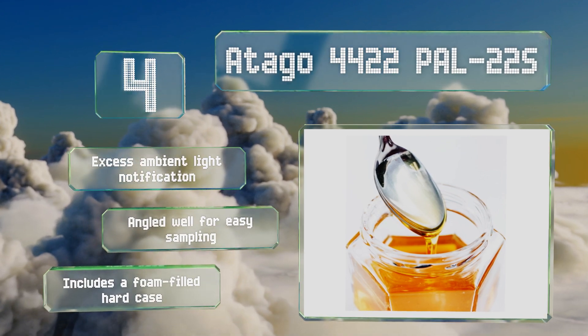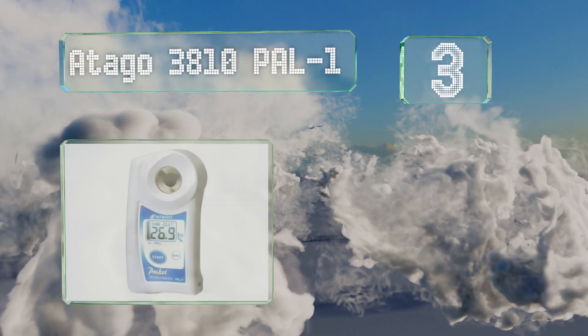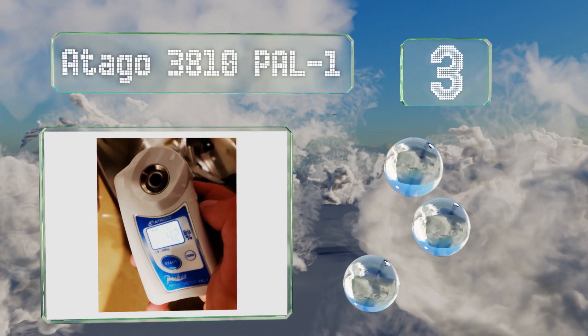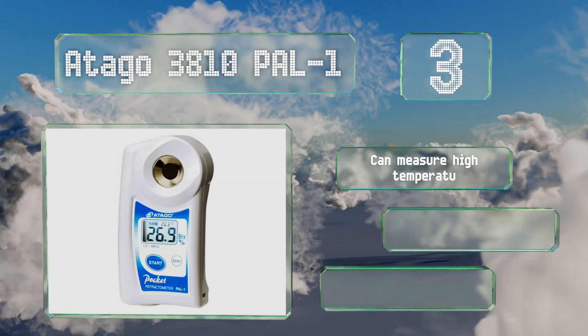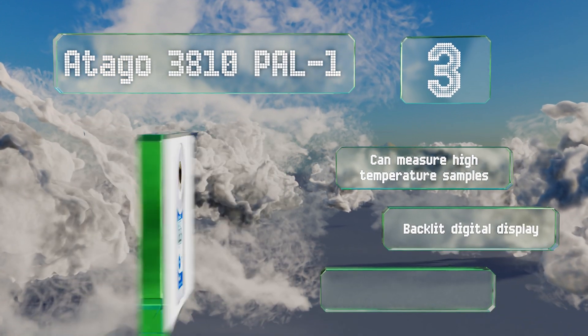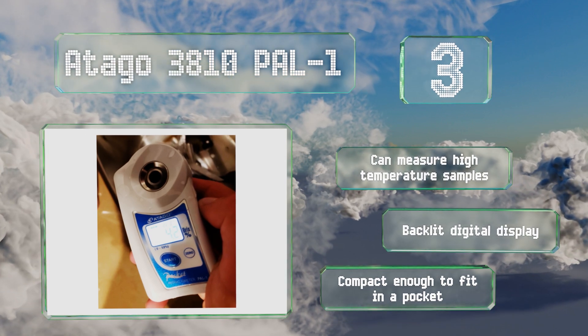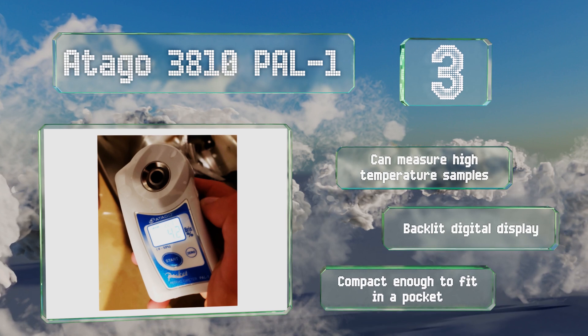Nearing the top of our list at number 3, the Otago 3810 Power Dash 1 has an IP65 waterproof rating, so it won't sustain any damage if accidentally splashed, and can be washed under running water for a simple cleanup. It requires just 0.3 milliliters of fluid to take an accurate reading. This one can measure high temperature samples and is equipped with a backlit digital display. It's compact enough to fit in a pocket.